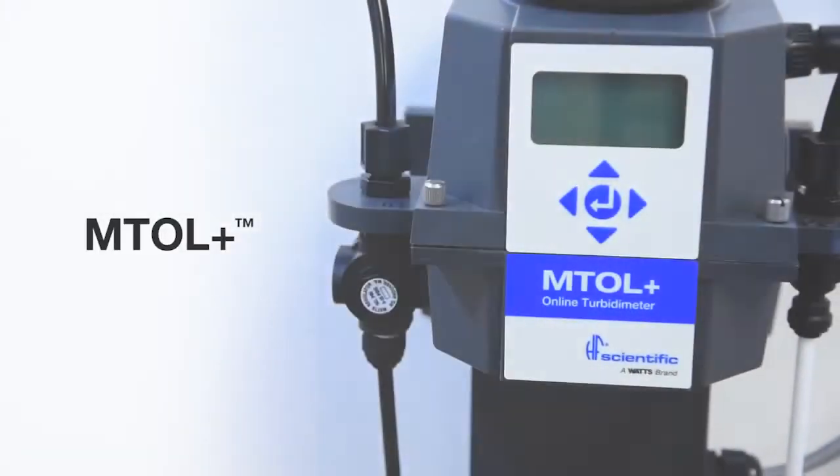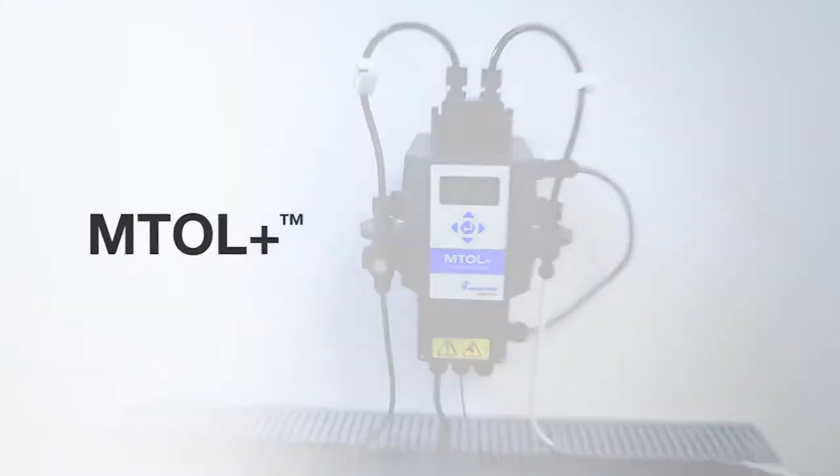When your application requires online turbidity measurement, all you need is the MTOL Plus.